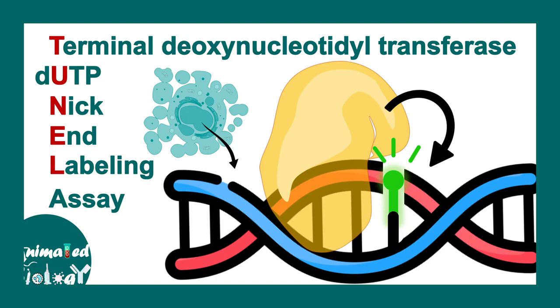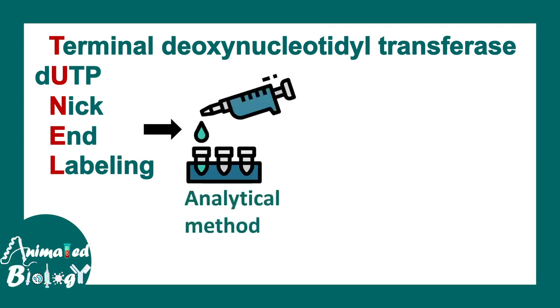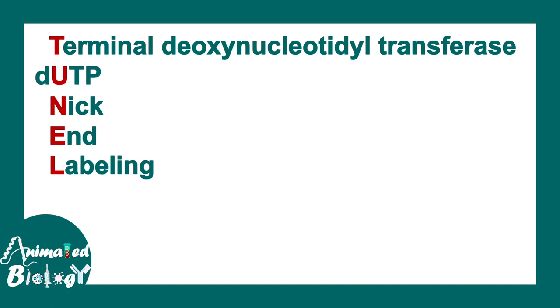In this video, we'll talk about the terminal deoxynucleotidyl transferase mediated nick end labeling method, or TUNEL assay. It's a mouthful of a term, but it's very easy to understand. The TUNEL assay is an analytical method to determine the status of apoptosis in a tissue or cell line.